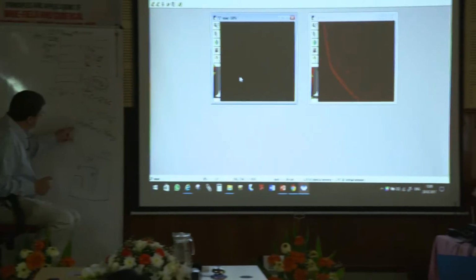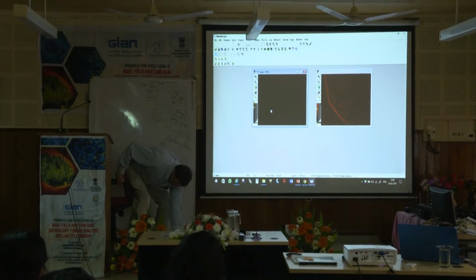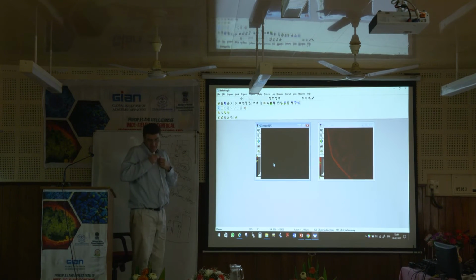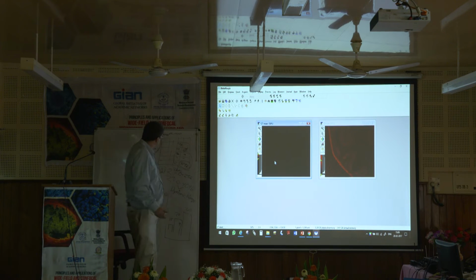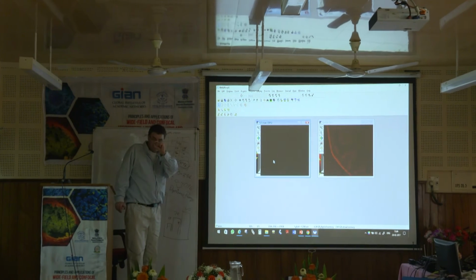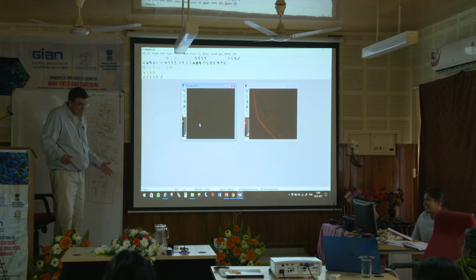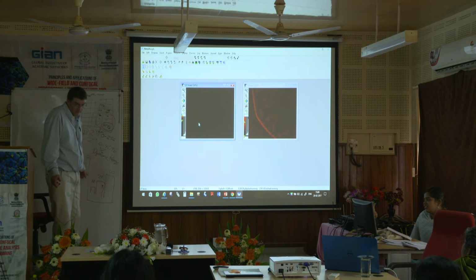So what if I made this line 1,000? I drew the line up to there. If I drew the line up to there, what would you say about that graph? It would look stupid. Okay? It would just look silly. It would be absolutely silly. This stuff would look like this big, right? But guess what? It's the same graph. It's the same data. Nothing has changed except how I look at the data.